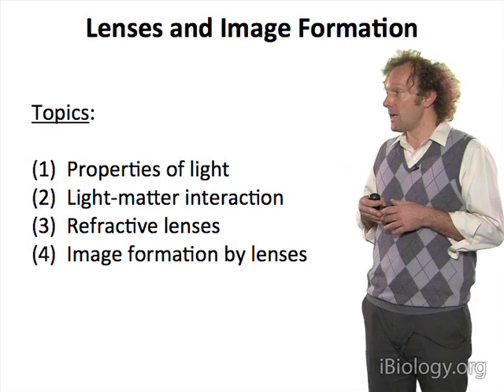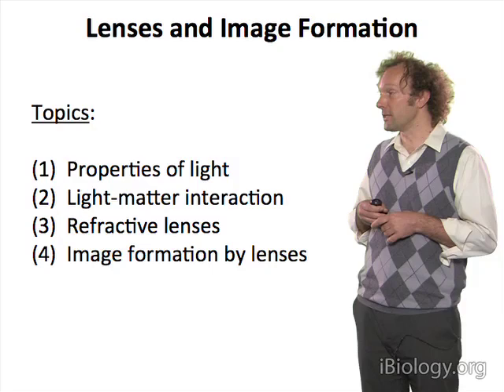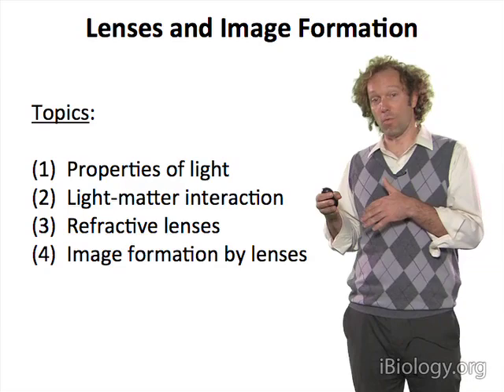And then we'll focus on refractive lenses. Those are the kinds of lenses that most light microscopes use to guide light, direct it, and use it to form images. And finally, we'll talk about the details of image formation and some of the things to watch out for, as well as some of the possibilities with those.